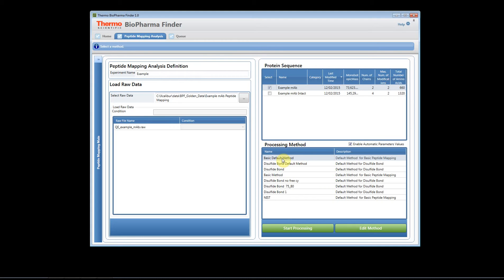Once you've really fine-tuned that method you can save the method and it'll appear here on the list. But now let's say that you have a new set of data that you'd like to process with those parameters.